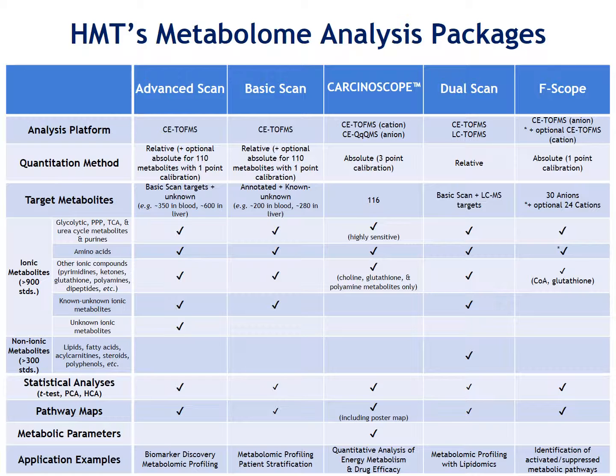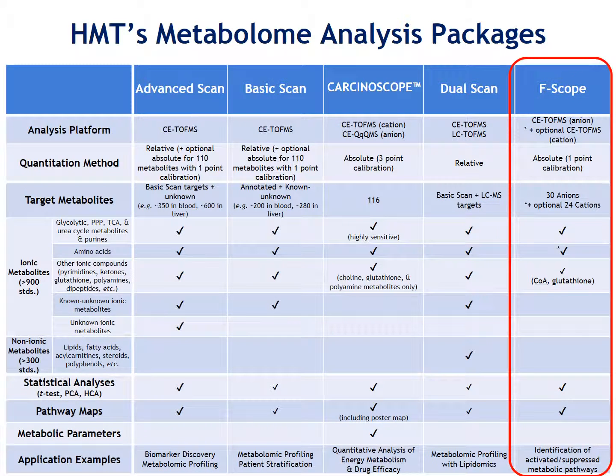Steady-state metabolomics provides insightful snapshots of cellular metabolic pools. Comparisons among samples can often reveal differences in glycolytic output or proliferation rates. However, due to the fluidity of metabolic processes, often subtle changes in preferred metabolic pathways can be missed. Heavy isotope flux analysis, which uses substrates including 13C or 15N, provides insight into the direction and flow of those labeled markers, typically glucose or glutamine.